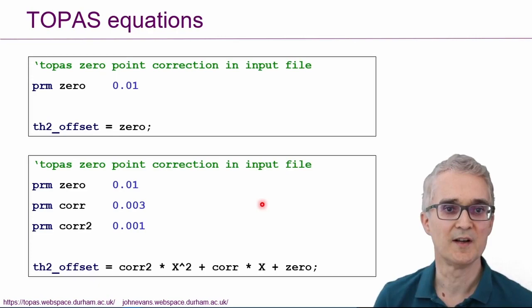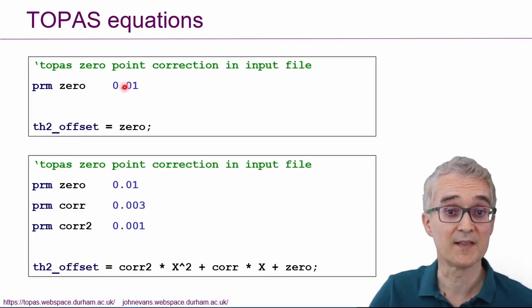So we started off using a built-in TOPAS macro to refine that parameter. Then we went through an example of how you could actually write a little TOPAS equation where you defined your own parameter called zero, you gave it a value, and in TOPAS you wrote an equation that the 2θ offset was equal to the value of that parameter, and you could refine that parameter.